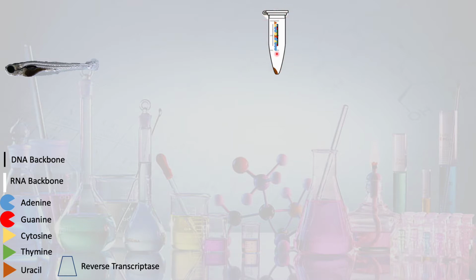So at this point, we're going to pretend we've completed our RNA extraction. So now in our tubes we have just the RNA from our samples. And if you look closely, again, all these different types of RNA are now in our samples. So that includes our desired messenger RNA, our tRNA, the ribosomal RNA, all the different kinds of RNA, right?